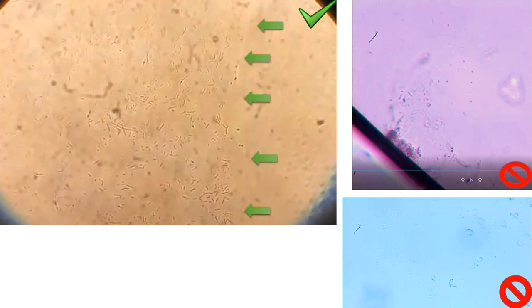Okay? So after 24 hours, that broth can simultaneously be used for the motility test, where you pick a drop of bacteria, put it on a glass slide, a cavity slide, and observe at the rim of the edges. Because oxygen diffusion is higher here, if the bacteria are motile, all will try to come to the rim. So that's how we will know that they are motile organisms. Do not confuse the cover slip edge of the slide with the rim of the drop. You should be able to distinguish that.